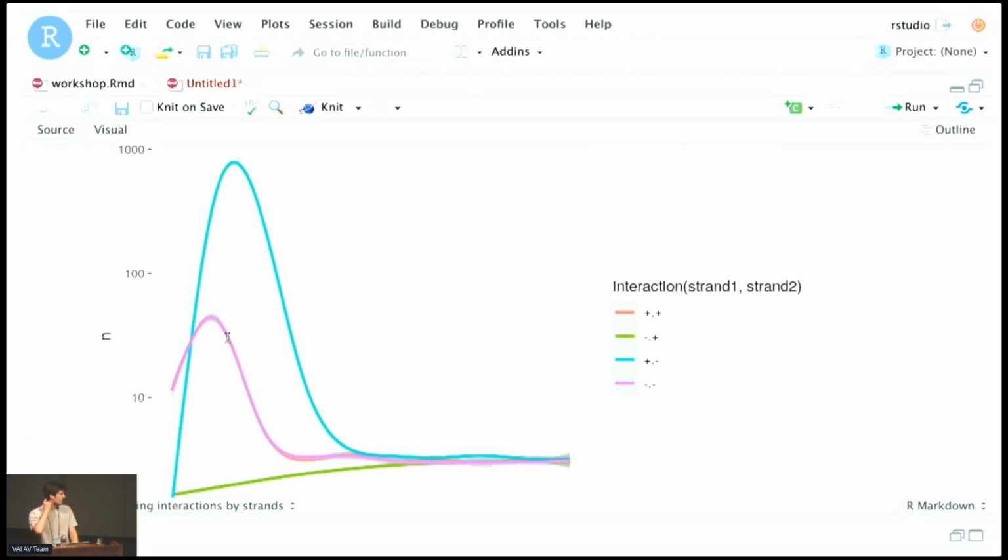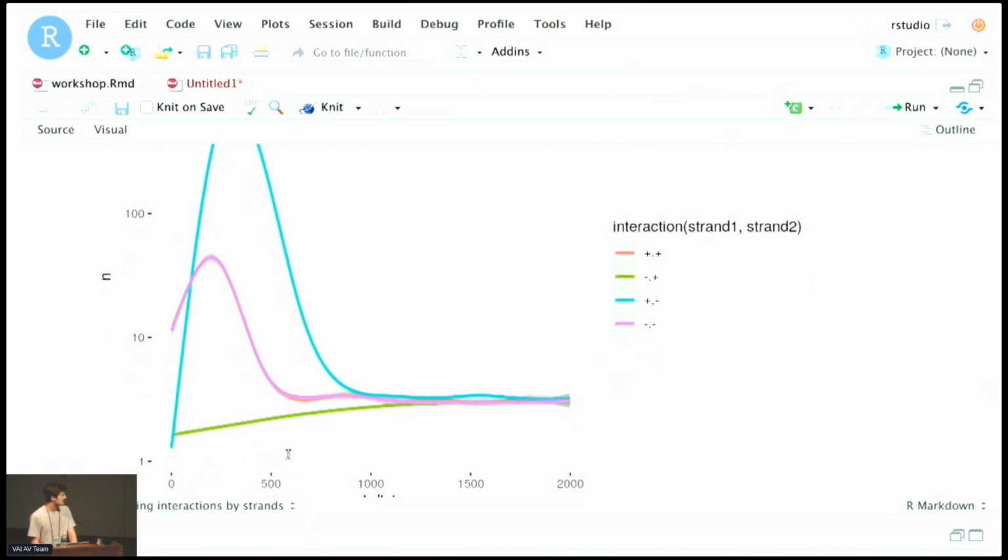When you perform chromatin conformation capture, you end up with a lot of religation when you do the experimental part of the process, and so you end up with these plus minus interactions being enriched at very small genomic distances. So people tend to consider that anything that goes away of this minus and plus in this plus minus distribution here, anything from here and closer genomic distances would be artifactual.